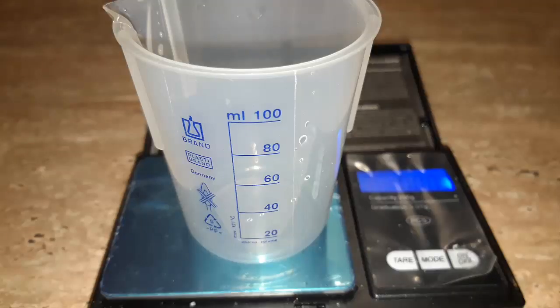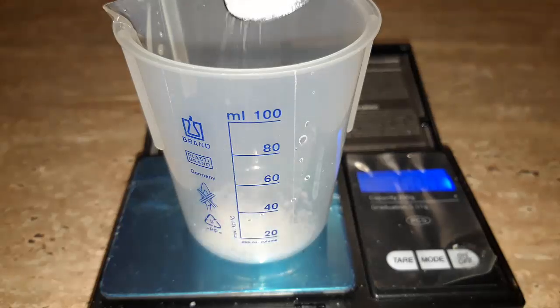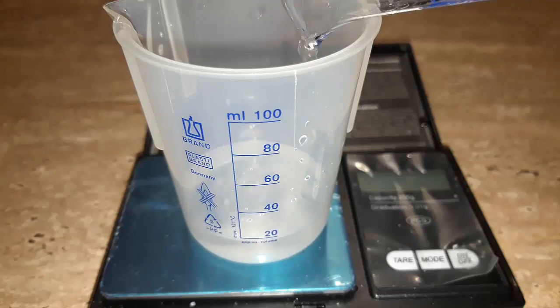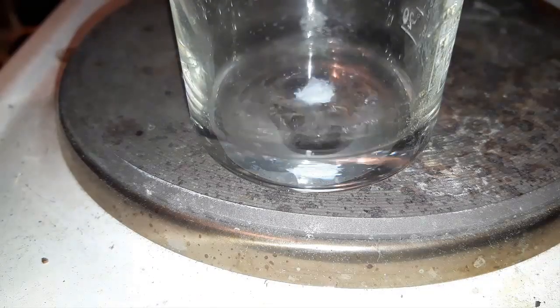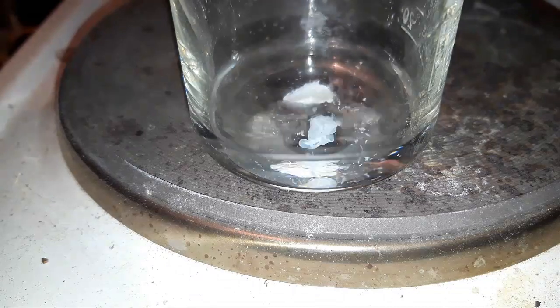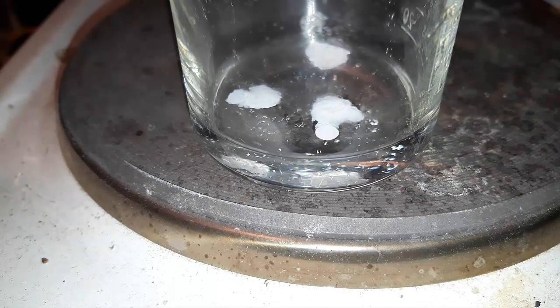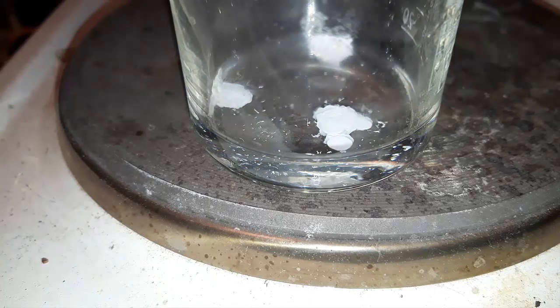Since we want to make a solid silver compound, the easiest and fastest route is to make a silver halide. For our double displacement reaction we'll be using sodium chloride, so weigh out 2 grams and add 20 ml of water. Add the sodium chloride solution to our silver nitrate — a white solid of silver chloride should drop out of solution.